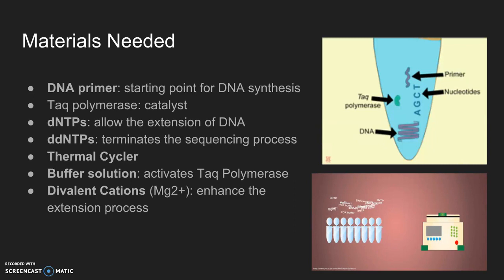The process of PCR takes place in the thermocycler, which is an instrument that effectively automates temperature cycling and incubation times. Prior to the introduction of the thermocycler, PCR was a lengthy process involving the transfer of samples between water baths of different temperatures and requiring much precision for timing each step perfectly. With the thermocycler, automation of PCR became a reality.